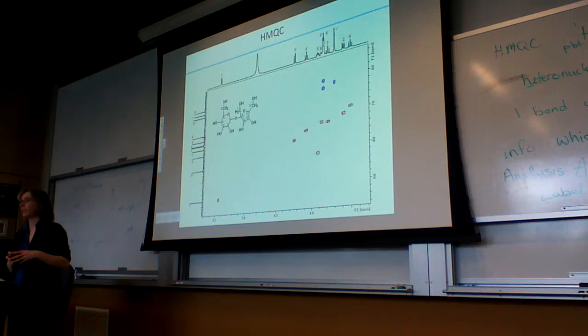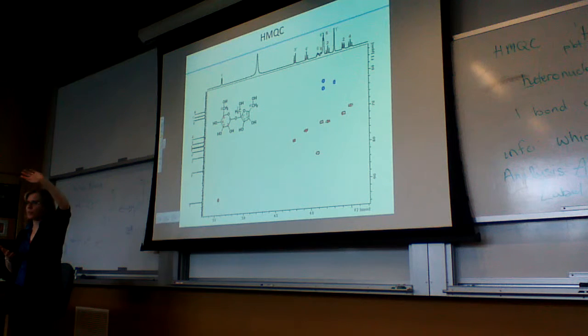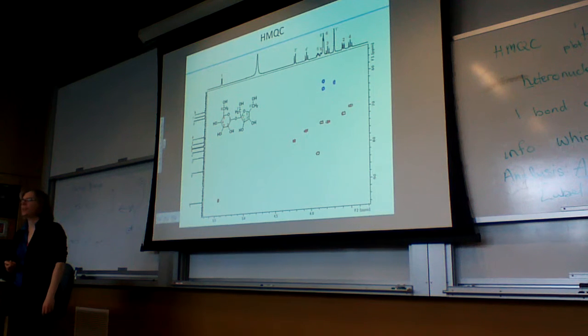And there are lots of different variations of 2D NMR, and they have all sorts of crazy acronyms to go through. So on Friday, we'll go through one compound completely, in the analysis of proton, carbon, DEPT, COSY, and HMQC.